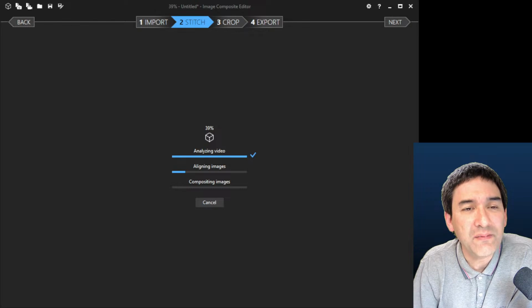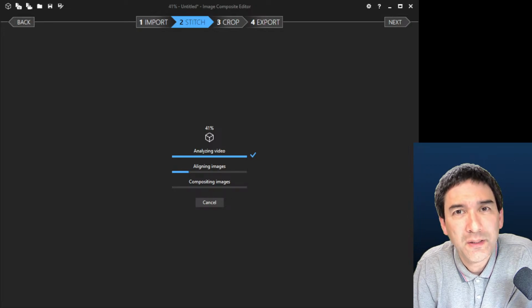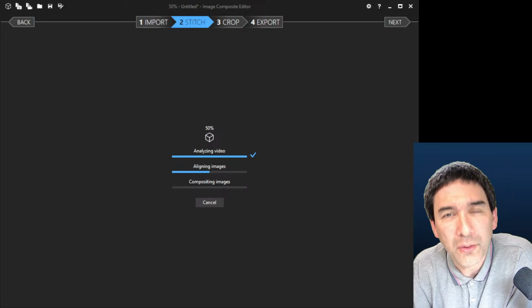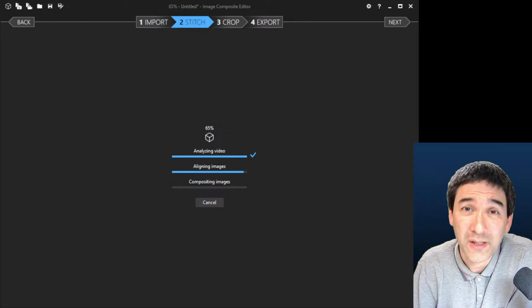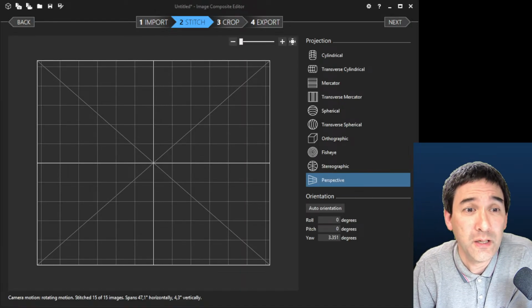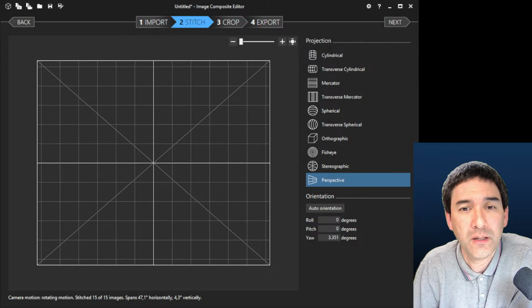A little bit of a disadvantage as well, I just need to say this, is if you've got, for example, auto exposure settings, this can be a problem because then the camera will always adjust the brightness. When you look at darker parts of the image, the camera will go up with the brightness, and if you look at bright parts, it will go down, and then sometimes it cannot match properly. So in this case, I think it might even be better to take actual manual pictures. See? And what do we have here? It didn't work. Okay? This is something that I've already experienced before.